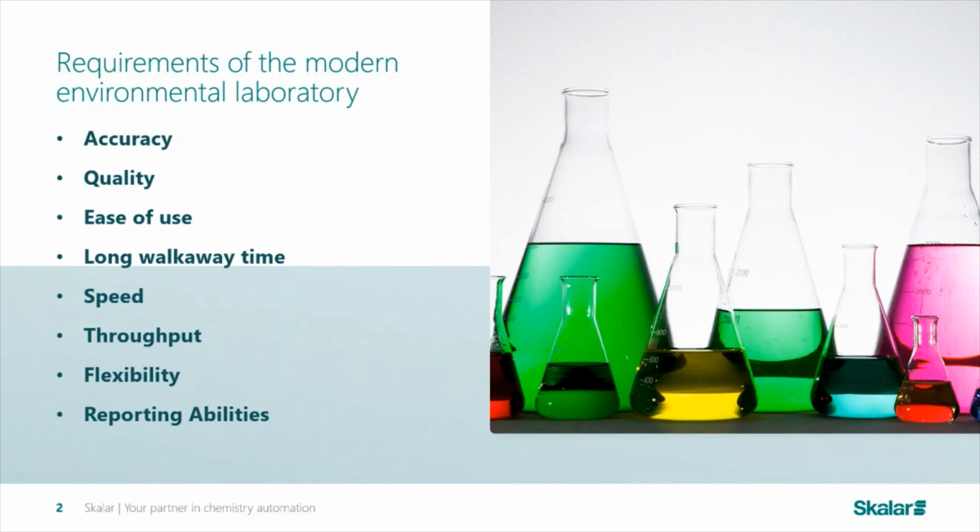That could be at a daily level, so the ability to add emergency or priority samples to a batch, as well as, say, more global changes, in the sense of being able to respond to changes or norm revisions, legislation changes, which might require the reporting capabilities of the lab to improve, putting pressure on the analytical performance of the lab and therefore the instrument. And of course, the ability to import and export results and to report different results in different formats.